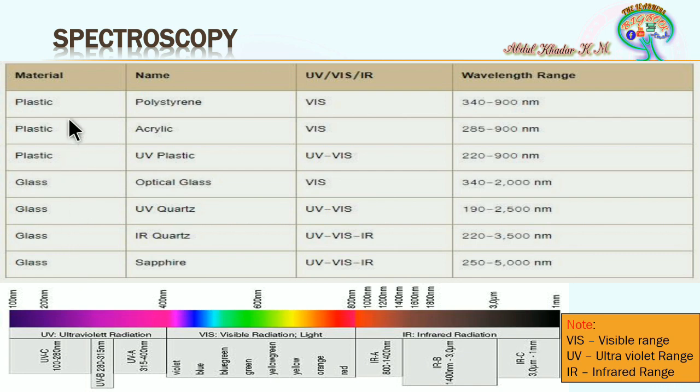Why do we have to use plastic cuvettes only once? It is because they are going to get scratches on them. Because of that you cannot use them more number of times. Because of the scratches, diffraction of the light may take place, and because of that, the absorbance values may differ with large errors.